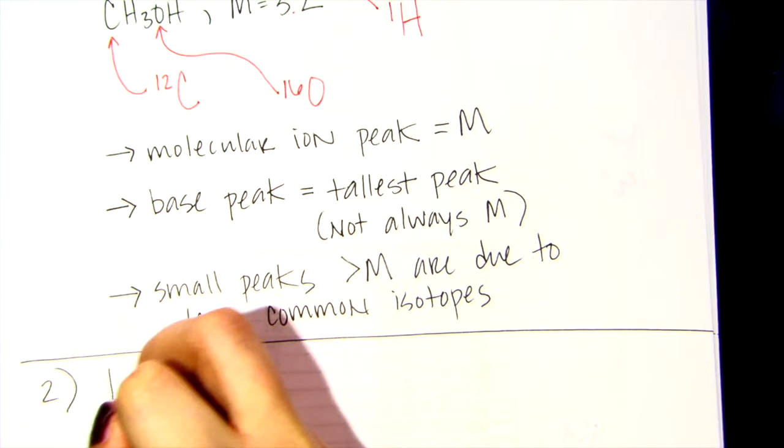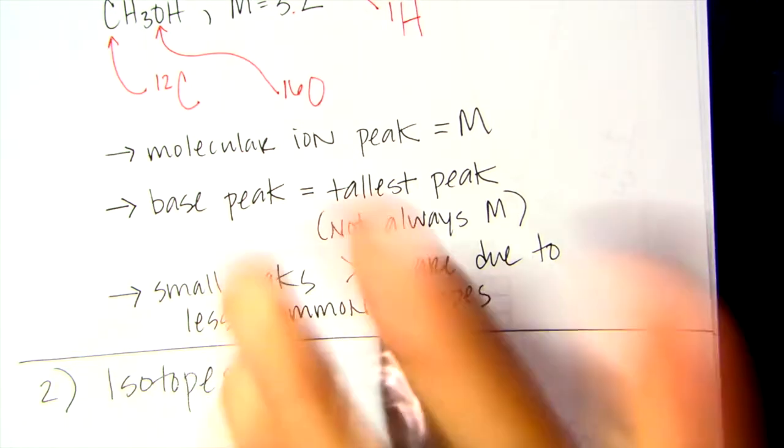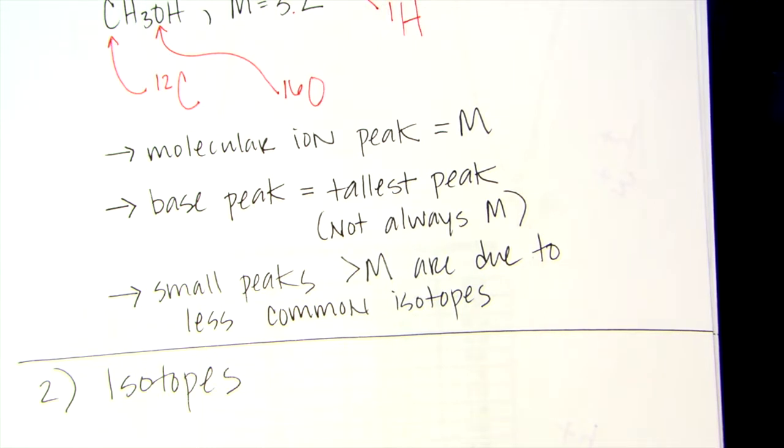Okay, so next thing you look for, so you can find the mass peak. And I'm just going to go through all the information, and at the end we'll put it all together and show you how to solve a molecular formula using all this information. So I'm going to go through the information, and then we'll put it all together in a problem.